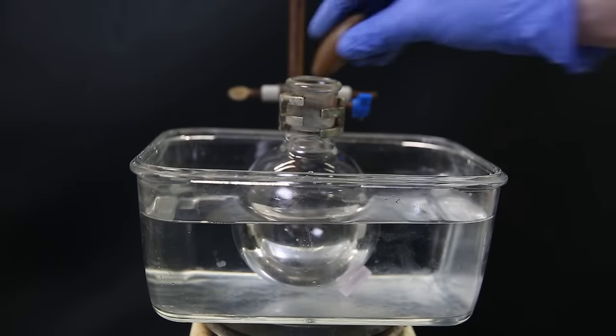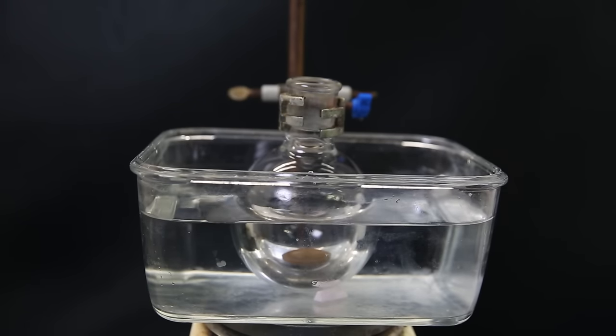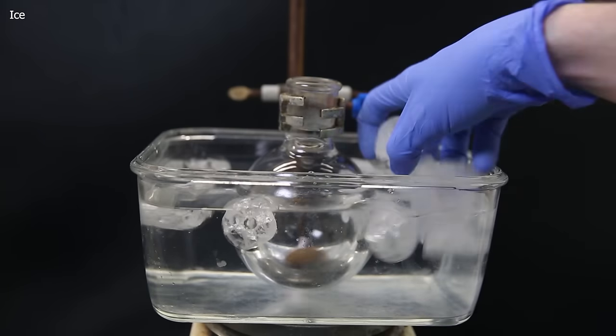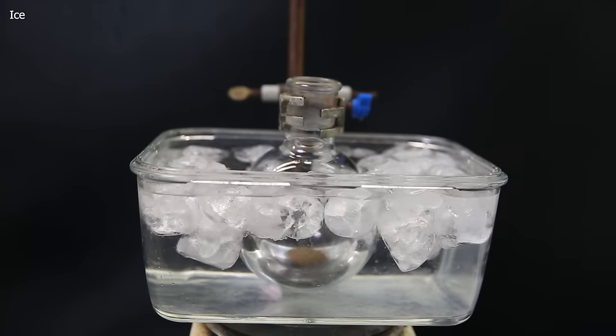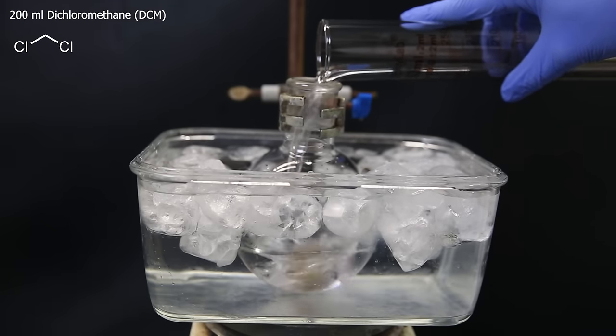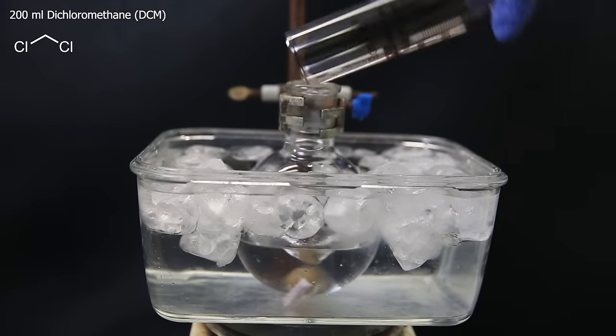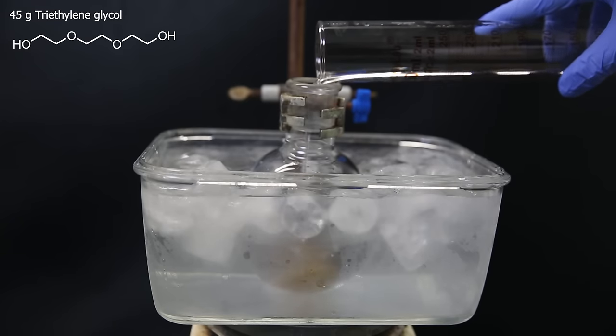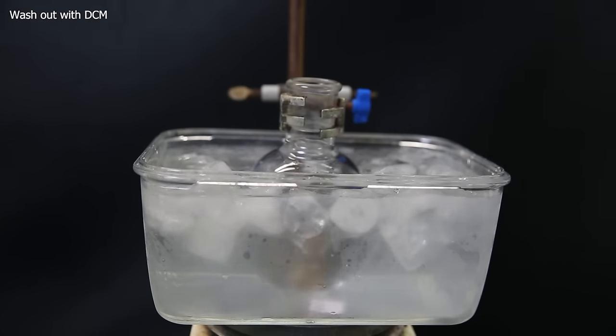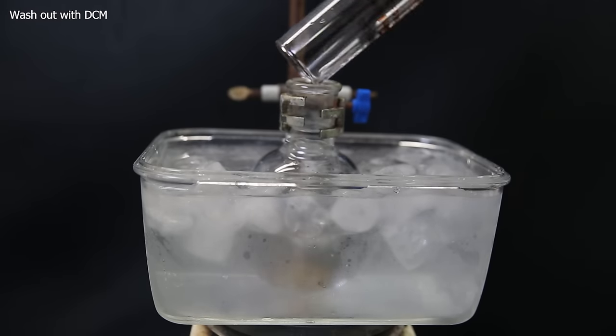To get started, I set up a flask in a water bath, and add a stir bar, then I add a bunch of ice into the water to cool this reaction. As a solvent, I add 200ml of dichloromethane, and then 45g of triethylene glycol as the first reagent. I also wash out the cylinder with some DCM, since the triethylene glycol is quite viscous.